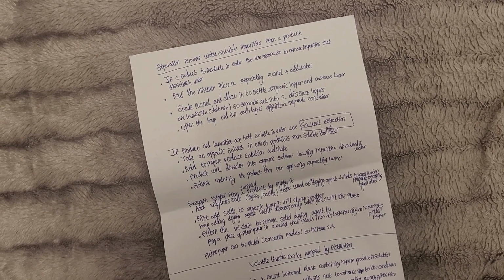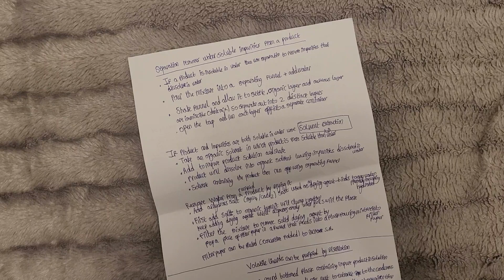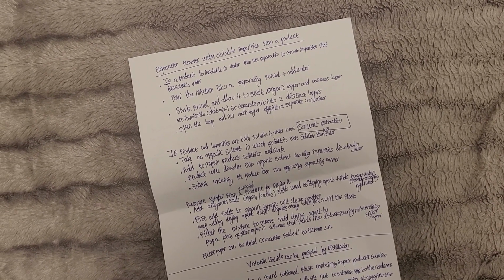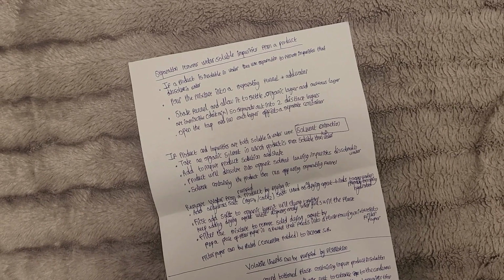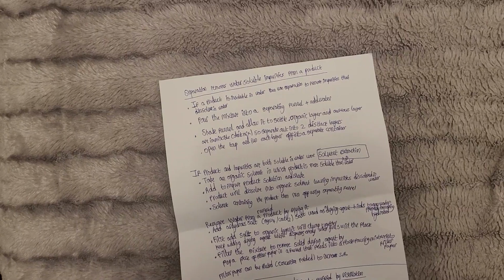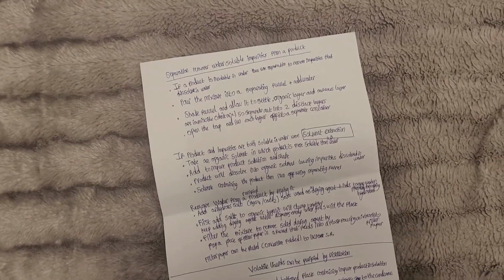First thing we want to do, pour the mixture into a separating funnel and add water. Shake the funnel and allow it to settle. What will happen is that the organic layer and the aqueous layer are immiscible. They don't mix, so they'll separate out into two distinct layers.